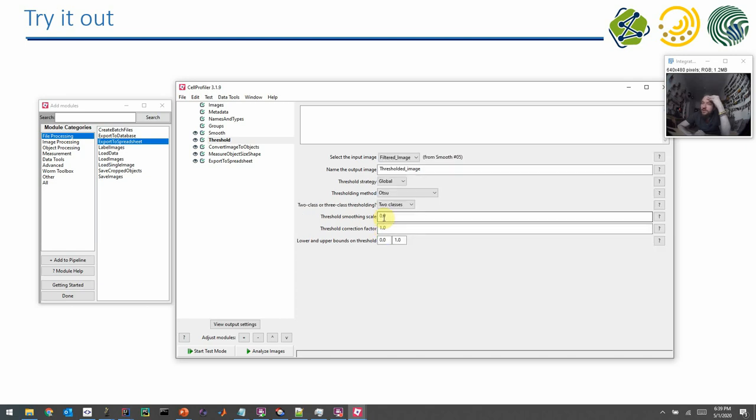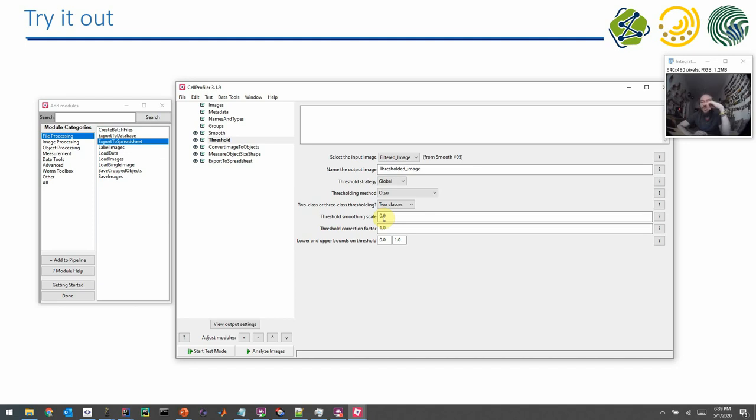For example here in this pulldown you find Otsu, and you know already how the Otsu method works. Maybe you know from the images I will show you later for the exercise that these images may be easy processable with the Otsu method. So then you can pick it here or you can pick any other method. But in general I would just leave the default parameters for now because they are kind of carefully selected by the developers of this tool. We can have a look on the results.